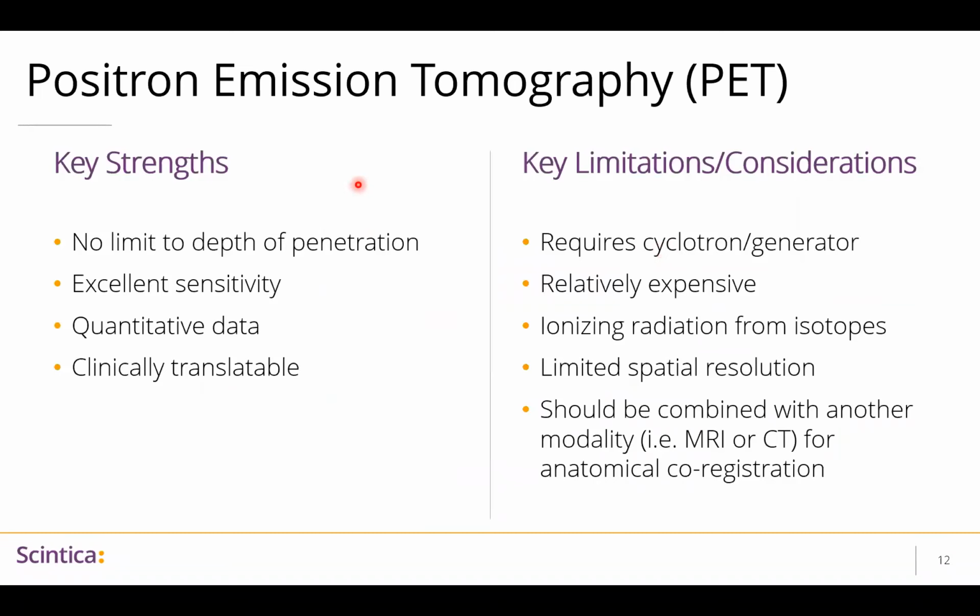So again, focusing on some of the strengths, there's no limit of depth of penetration. There's excellent sensitivity, so when we're designing new contrast agents, we only need small quantities. The data is truly quantifiable and of course, clinically translatable. This is very commonly used in the clinic as well.